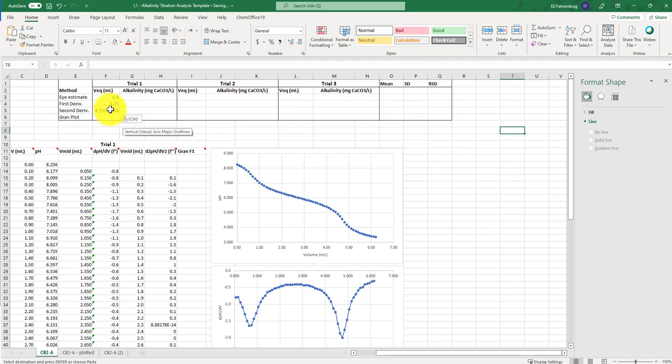We're not preserving the correct number of significant digits here because I'm not reporting this yet. I'm going to use this to compute the alkalinity later, and that's what I'll use to compute an uncertainty, which will then constrain the number of digits that I actually keep. But for now, for simplicity, I'm just throwing them in there like that. Okay, so you can see that we're changing, right? Our initial eyeball was pretty close, 4.8. Our first derivative was slightly less, and our second derivative was slightly less.